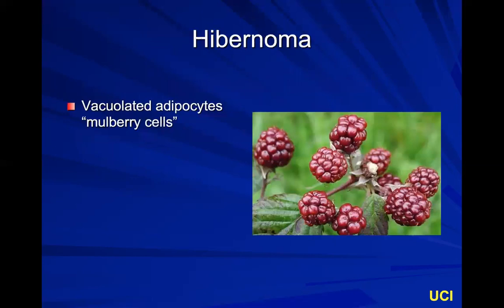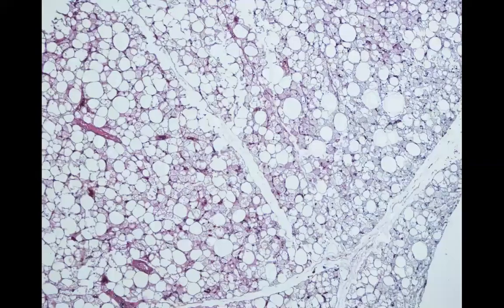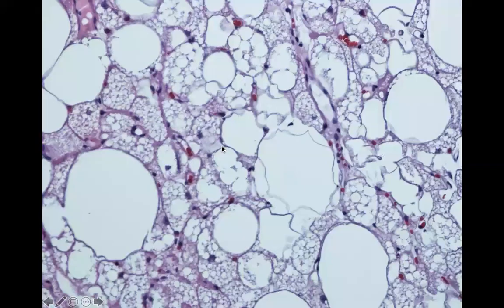A hibernoma is the fatty collection seen in brown fat. It's known for its mulberry cells. Looking at the image, it doesn't look as clean as a lipoma because the adipocytes not only vary in size and shape, but they have all these little vacuoles inside — these are the mulberry cells of a hibernoma. Nothing else looks like this.